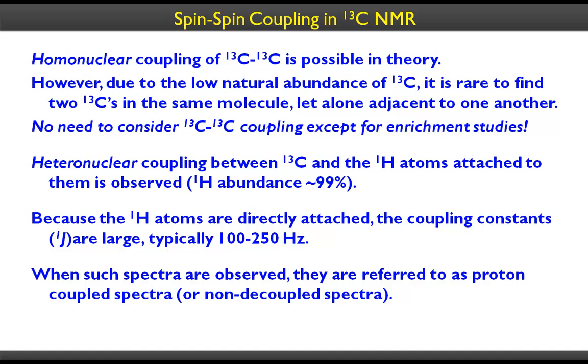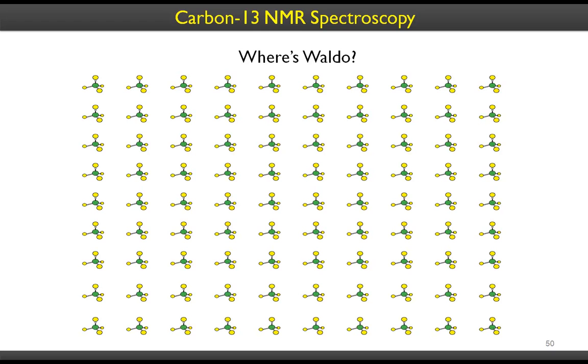But here in the carbon-13, you have larger coupling constants because of the heteronuclear coupling. It's not homonuclear coupling. Hydrogen is a different type of magnet and carbon-13 is a different type of magnet. Hydrogen is a bigger magnet, C13 is a smaller magnet, because of the gyromagnetic ratios that we talked about. So there is coupling.